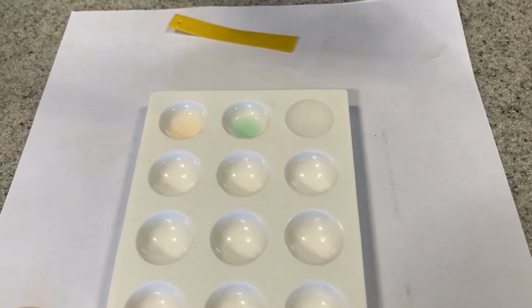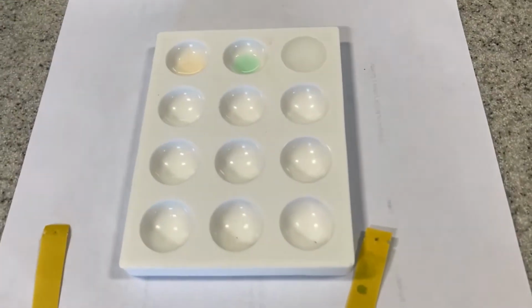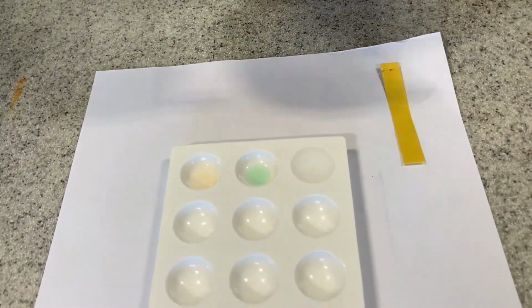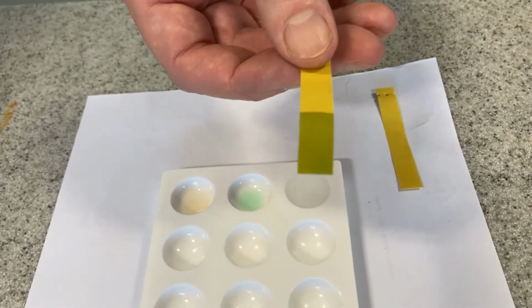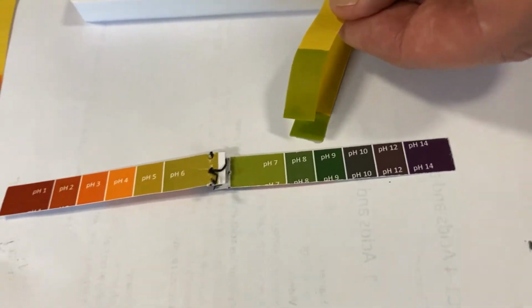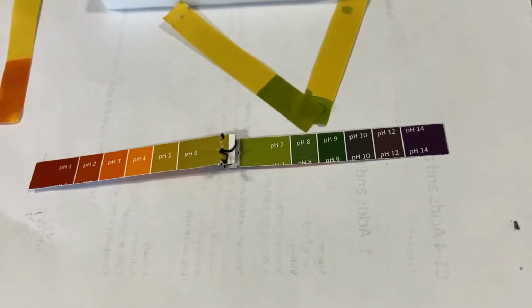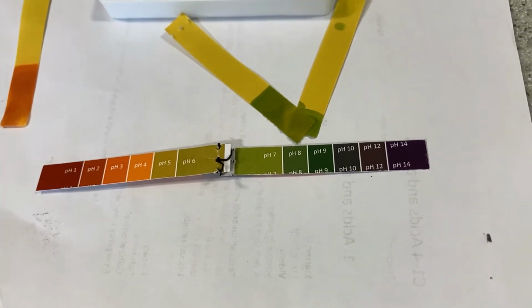Oh. Emergency! You have reached an error. You have added too much of your sample. I think that's a good point there. I have put too much stuff in there, but actually I'm going to run with this. I think it won't affect the results, but obviously that is very bad practice. Right, let's have a look. Straight away, changed colour. That again is somewhere around there, a weak alkali, which tells us it's an alkali, and that's why people have it if they have an upset stomach, because your stomach contains acid and it will neutralise it.